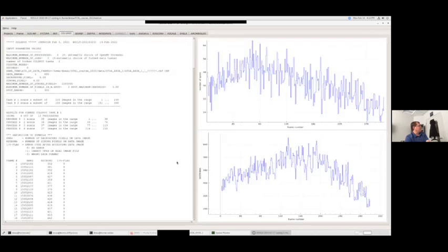Okay. If you see any frames where that number drops down to single digits or 0, that's indicating that that frame is blank, which might be an indication that you've rolled off the crystal, or during the experiment, the beam was lost for some reason, so therefore you're not getting any spots on that crystal.